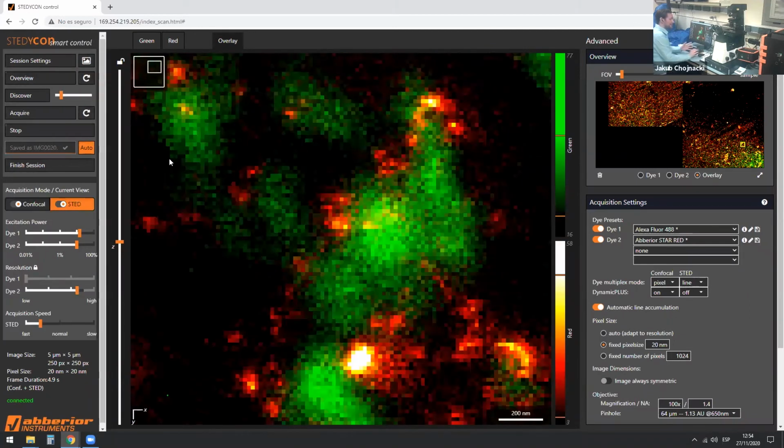So as you can imagine, if we study this carefully, super-resolution microscopy allows us to determine the proportion of virus particles which have only a single cluster of envelope proteins, or a more semicircular, more distributed clustering of the envelope proteins on the surface.